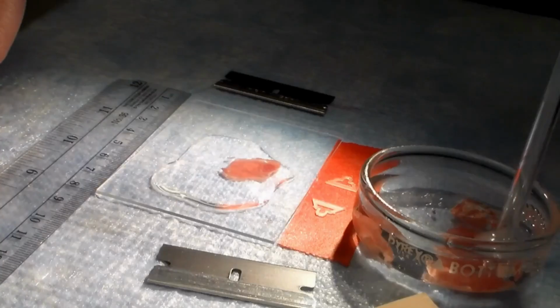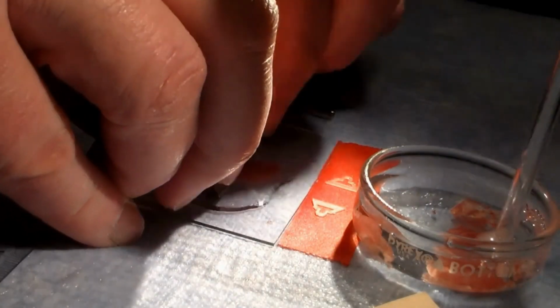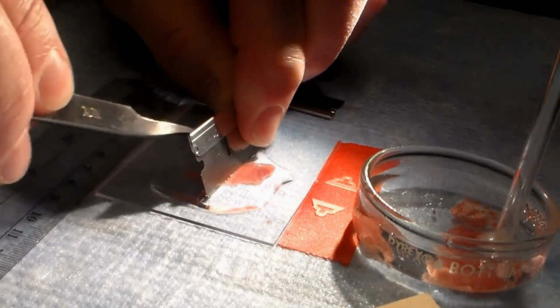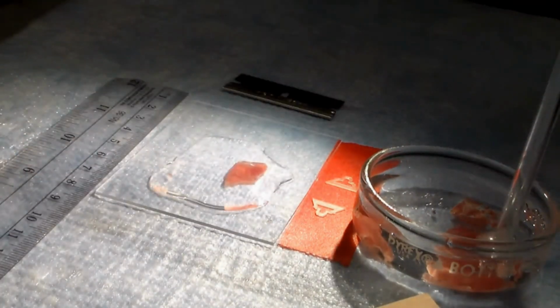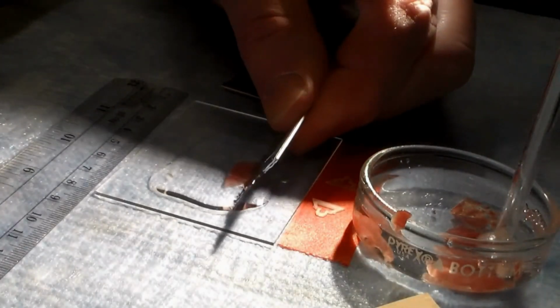Now you might see some scoring that's going up and down. That's scoring from the razor blade. But the fiber orientation and the force generation is left to right. Having oriented the slice appropriately, we then use another razor blade to cut the slice into a square or rectangular shape.